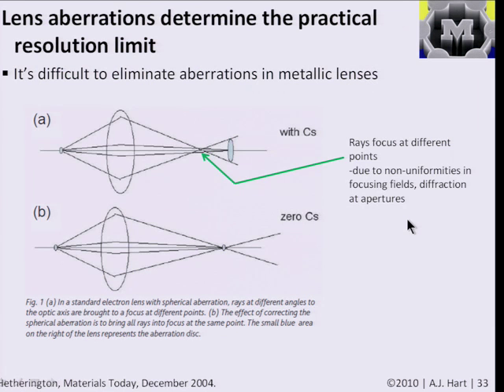So, as with optics for optical microscopes, the design of the optics and the understanding of the optics in the electron world are also important. And that is one of the things that determines the true resolution limit. And that's what's letting us climb that last part of the curve up to what the graph called corrected TEM. So the real details aren't important here, but basically the approach is to create techniques and algorithms that understand and correct for the aberrations in focusing the electron beam.